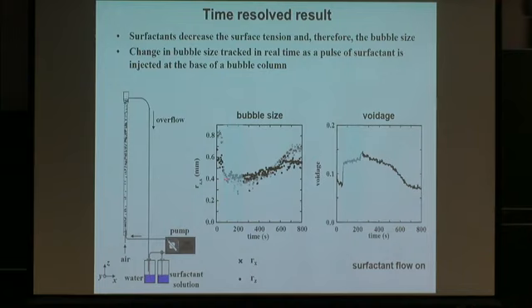We put in the surfactant, and immediately the bubble size drops to below 1 millimeter diameter, and it also collapses to the Z and the X. So we can immediately see that we're getting spherical bubbles, and then as we stop it, we see slowly the evolution as the surfactant gets entrained out of the system, and so it returns to these larger elliptical bubbles.